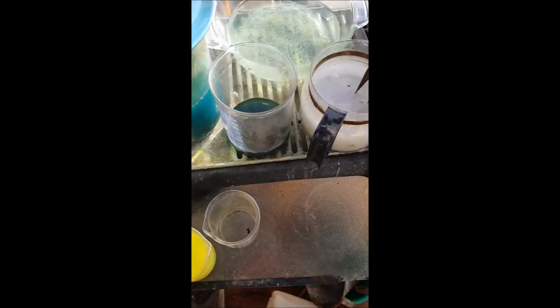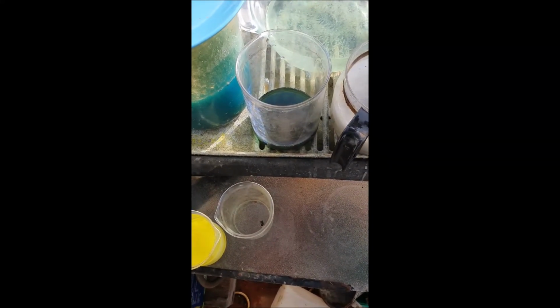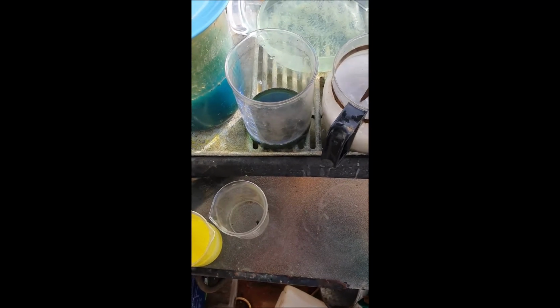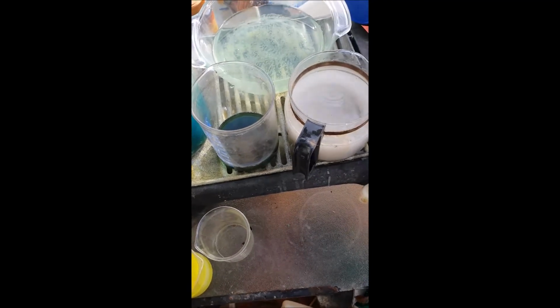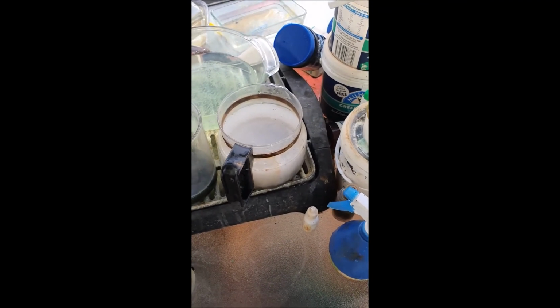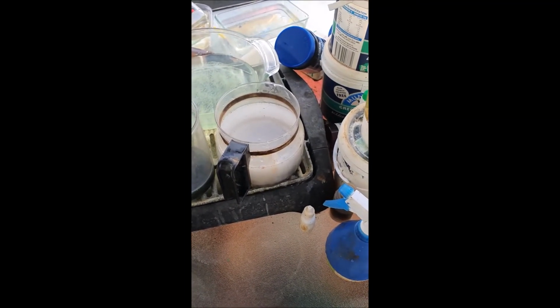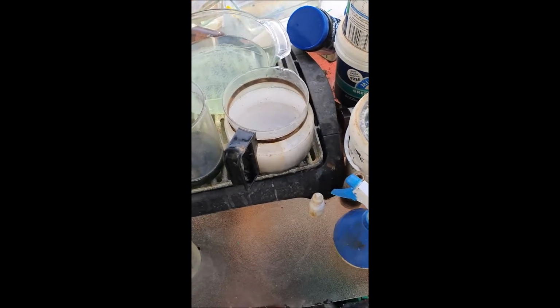I was careful. I'm just going to give this a little bit of a stir, make sure it's all mixed up, and I've got my hot plate there on heat. It's only on low. I'll turn it up just a touch. About there, about halfway. And now just let it sit and eat all that metal away and turn into copperas. Well, we'll come back to that when it's nearly done.